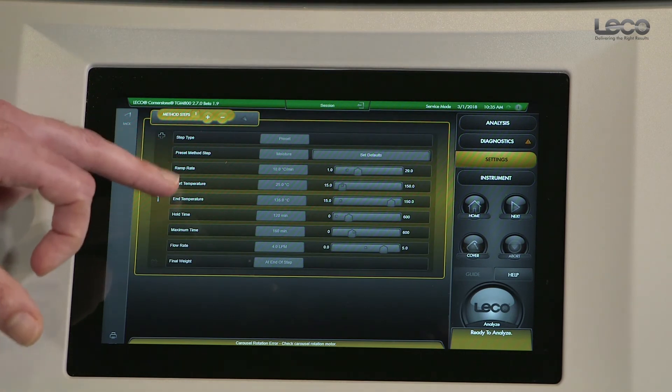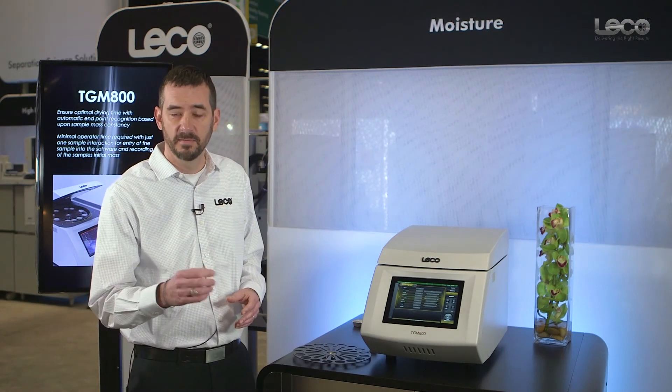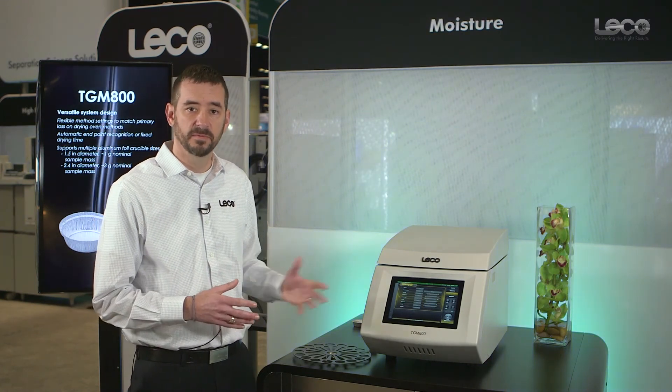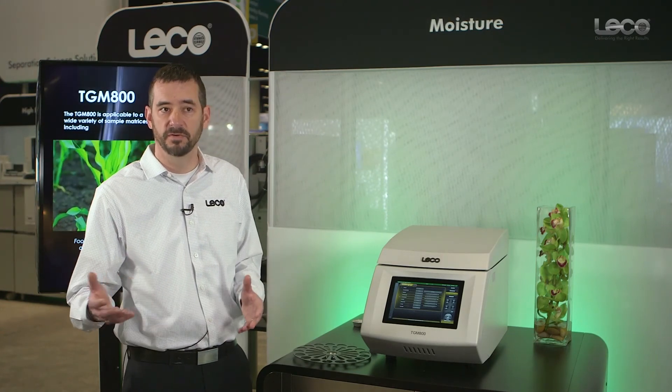Within the parameters, you can optimize ramp rates, oven temperature set points, and define either a fixed time or a time based on sample mass constancy. Fixed times replicate manual methods quite well — generally fixed times of one, two, or three hours.